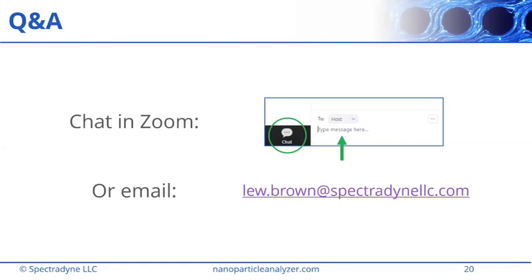Beyond that, the other point we like to make, and we've got some interesting data we can share with you, is that if you look for protein aggregates at smaller sizes, you'll detect them much earlier. By the time you're seeing aggregation at the 2 micron and larger size, you've got a pretty bad formulation, or you've stressed it to a very high degree.